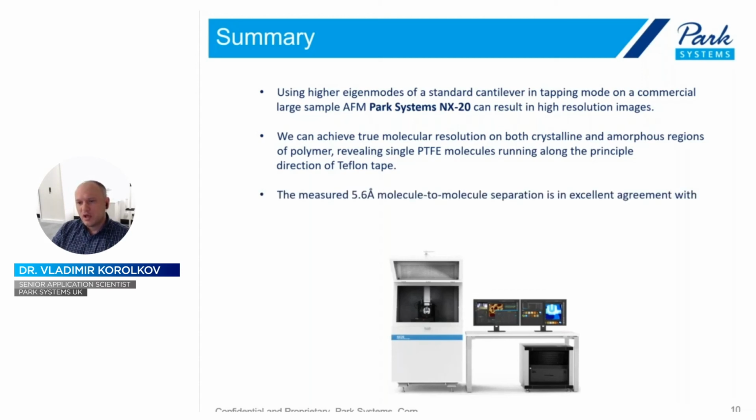And crucially, we provide almost the same level of precision as you can get from the diffraction data. You can measure the same 5.6 angstrom molecule to molecule separation, or lattice constant, that you can get from the bulk techniques. And that is important. That gives you confidence that atomic force microscopy provides data that you can cross-correlate with other techniques, and that's important when you want to take a broader picture of the samples that you investigate.